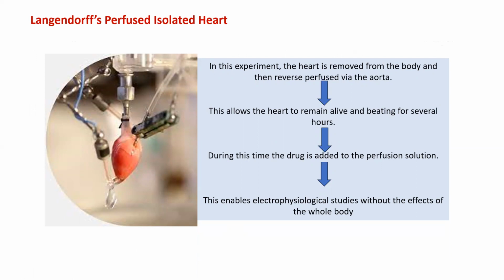isolated heart preparation. So this is an experiment where the heart is removed from the animal body and then reverse perfused via the aorta as shown in the figure.